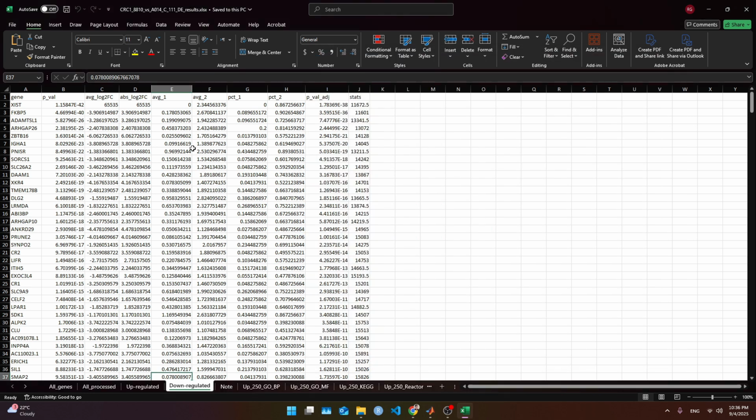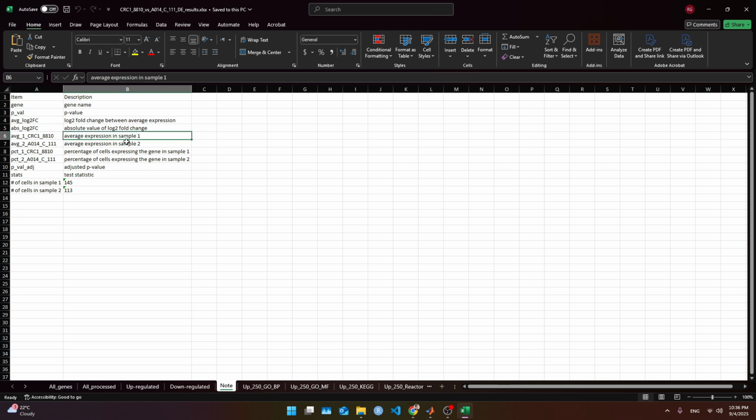And that summarizes. Here the difference is that we have the fold change. It's how much the gene expression differs, and the p-value accounts for whether it is statistically significant, accounting for all the cells. Those are single cells. And we can look at the next note, and it mentions all this, just to be aware what every single one of those quantities means. And what is in the next tabs is the Enrichr analysis.